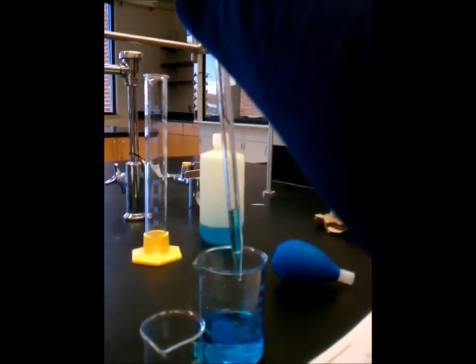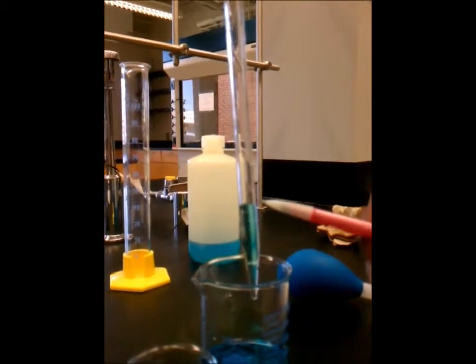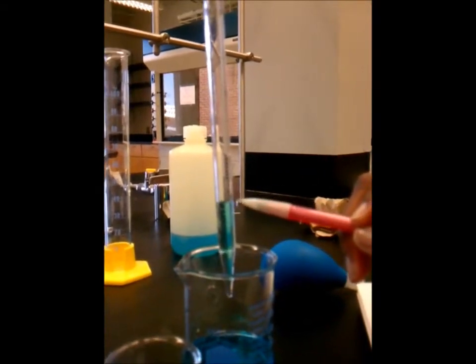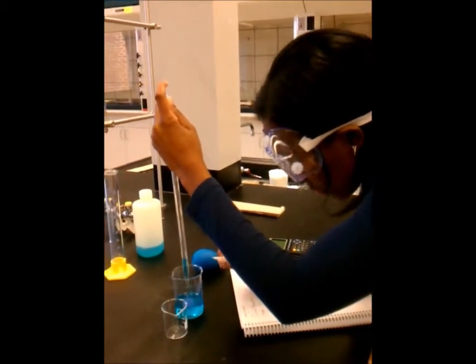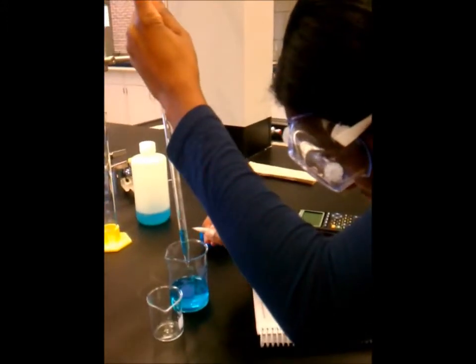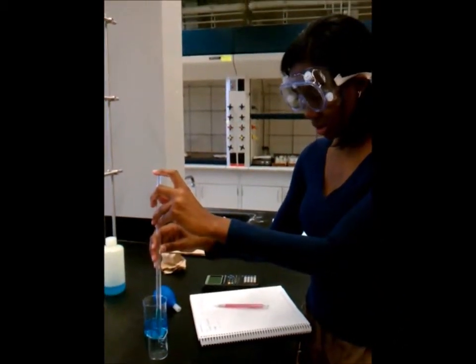I'm going to measure by the meniscus, and that is the concave in the solution. The meniscus happens because the water molecules are attracted to the sides of the glass. And then I'm going to release after I measure, and that is going to be 10.2. Drop some solution out into the empty beaker.